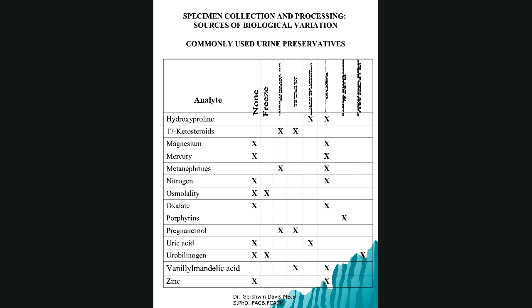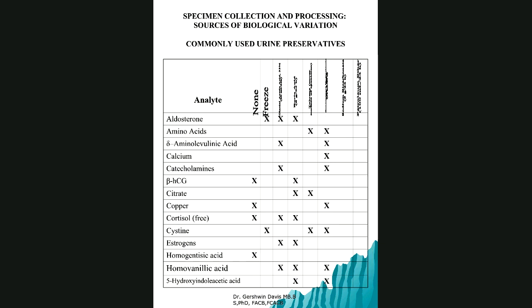And when you're giving it to the patient, you normally have to add sometimes 10 mils of preservative. That preservative, maybe you'll see it better in your actual PowerPoint, could be things like HCl, or boric acid, toluene. So caustic substances, liquids.